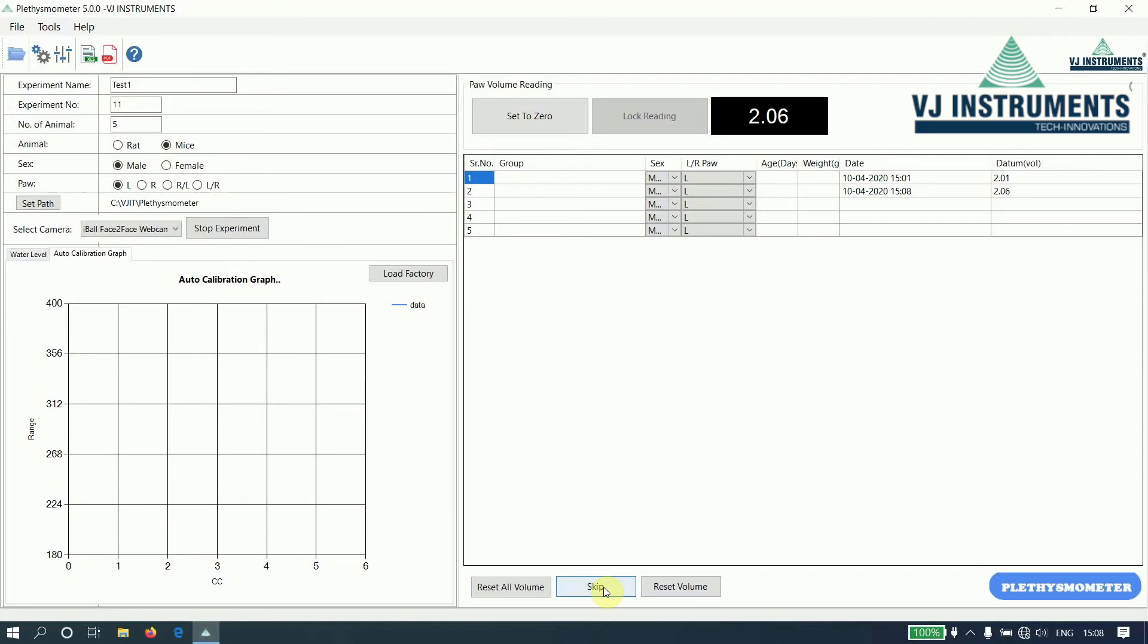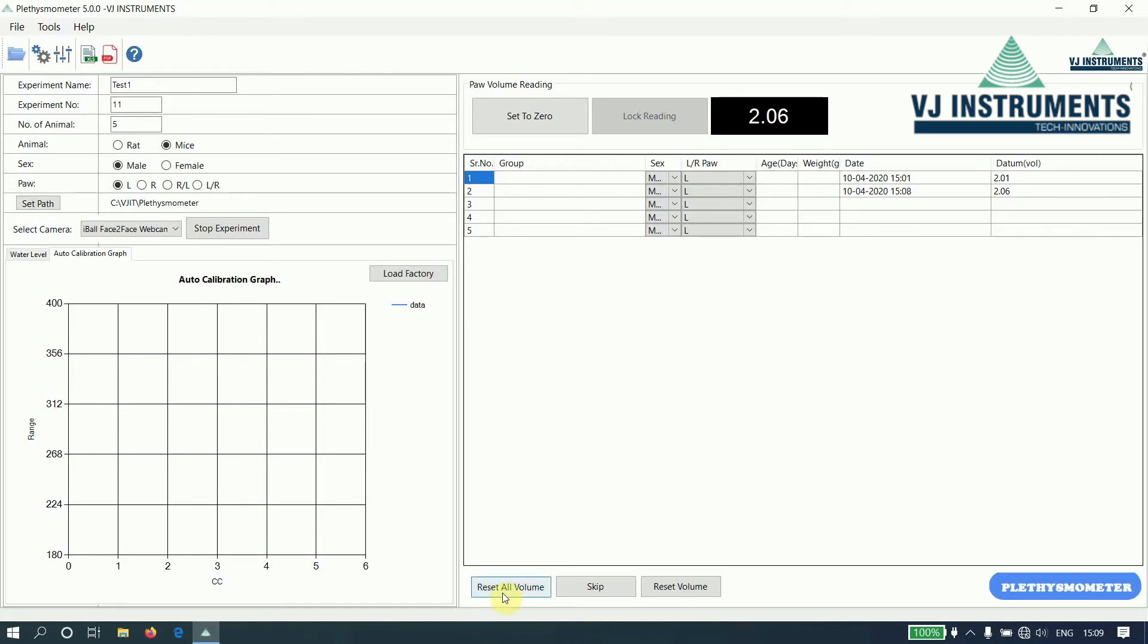This skip button is used to skip the current experiment. The reset volume button is used to reset the current value and perform the experiment again for that particular serial number. And the reset all volume button is used to reset all the values and perform the experiment again.